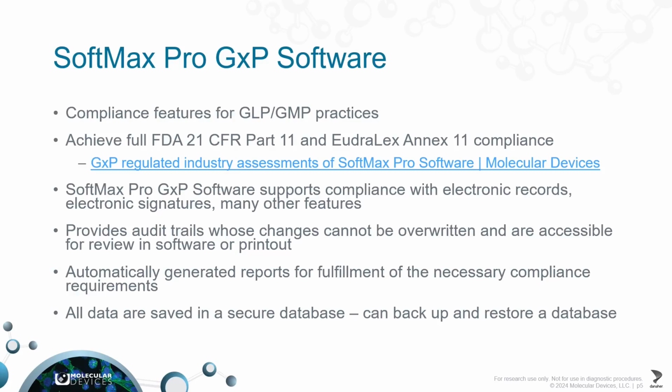So for details on how, rather than discussing them here, I'll go ahead and refer you to a Lab Notes article that's on our website. And this lays out very clearly what Part 11 and Annex 11 are, what the responsibilities of regulated customers are, the impact of compliance versus non-compliance, and plenty of other useful information if you're interested.